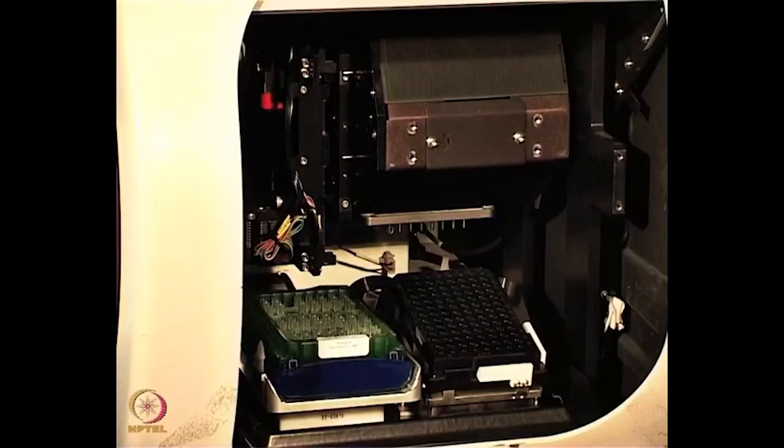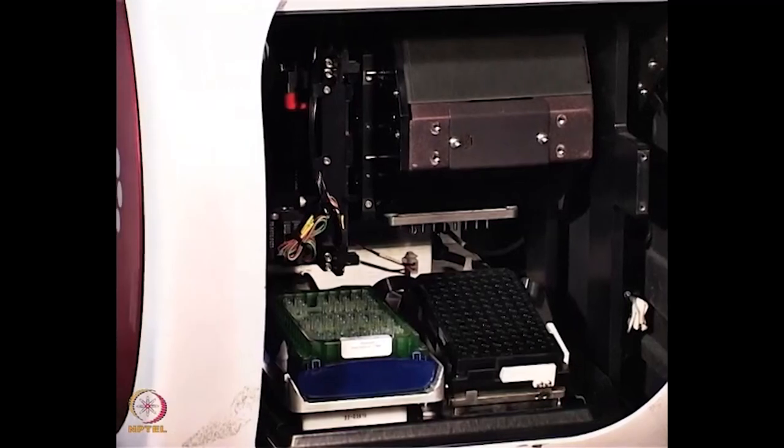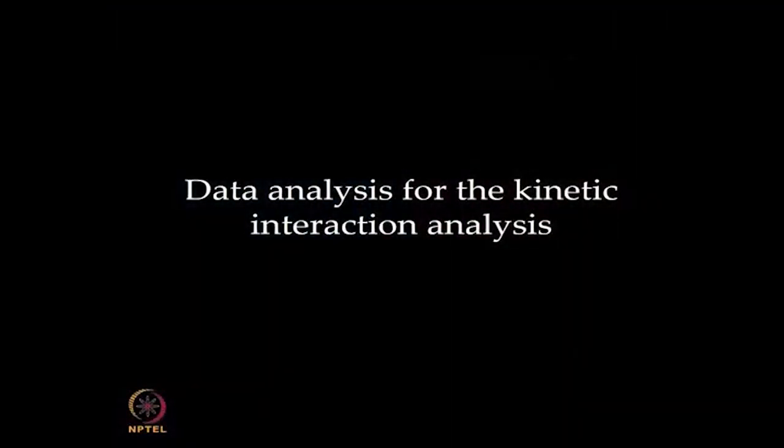Once the dissociation step is performed, the sensors are re-racked back to the sensor tray, and the robotic arm moves to its original position. So now acquisition is done. Now we have to go for the data analysis.